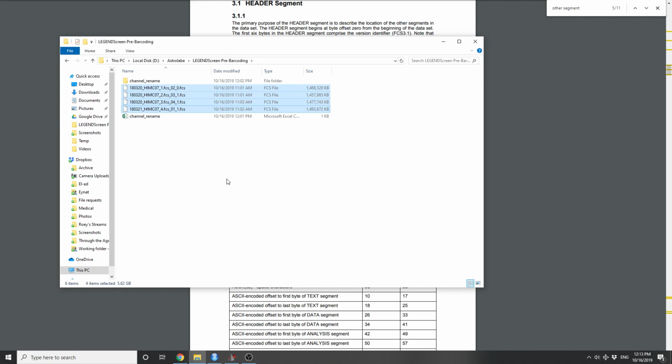So, first of all, if you do use an R script or FlowJo or Matlab to manipulate your FCS file and the new file is significantly smaller, then that is usually not a reason for concern. This is just the other section that is no longer necessary and has been stripped down by whichever software you're using. The second thing to be aware of is that, again, this should not really affect your downstream analysis. So yeah, make sure that nothing else is lost as part of your script, but you can still use the file and all is fine.